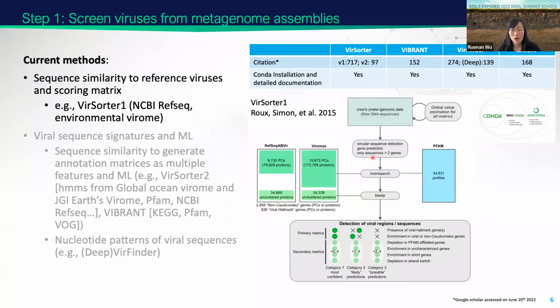All these listed tools are relatively easy to install, with detailed documentation on their homepages. You can also install them with Conda, so you do not need to worry about installing the dependencies or the dependencies being incompatible with each other if you install the tools in a specific Conda environment. If you have not used Conda before, I highly recommend checking it out. Now we have several candidate tools to use. The next step is to understand the methodology they applied and the supporting theories, which will help you select tools that are more suitable for your own study.